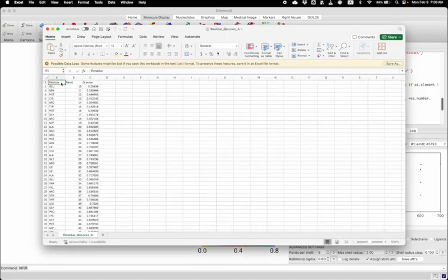Here the first column is the residue type, so glutamate, asparagine, methionine, and so on. This is the res ID, so residues have increasing numbers along the chain, and then the Q score averaged over all the atoms in the residue.